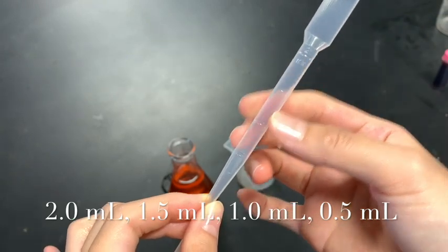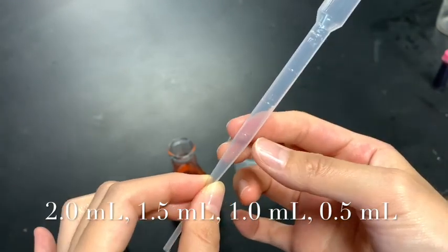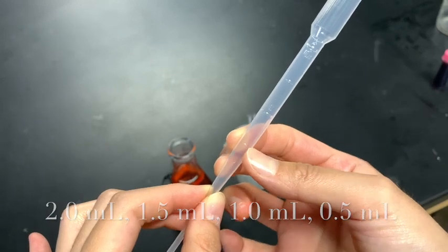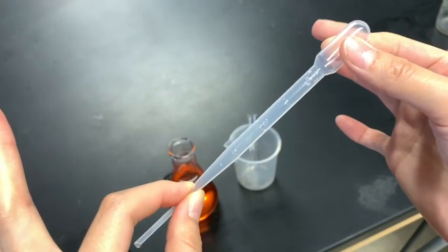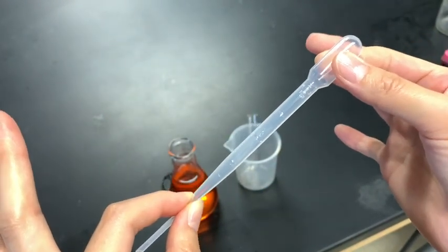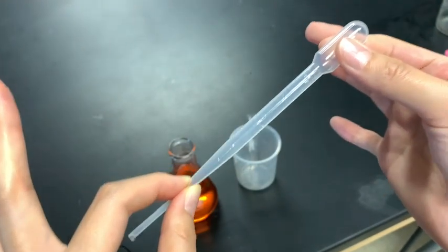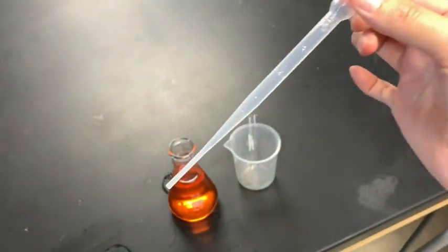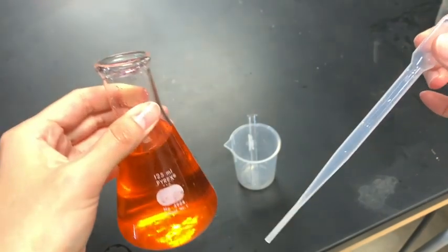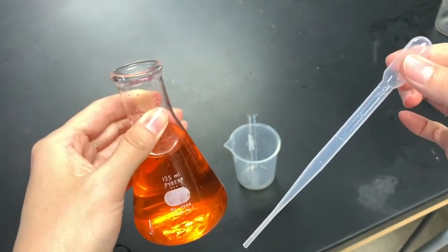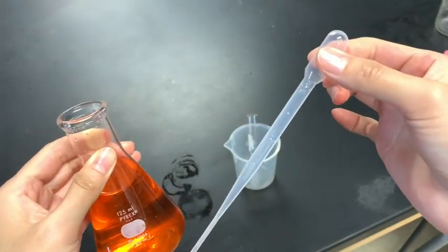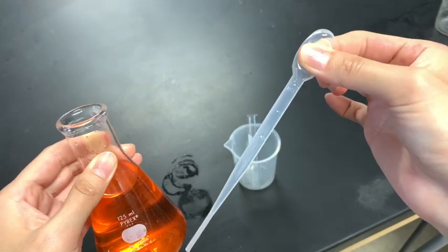In this video I'm going to demonstrate how to transfer 1 milliliter of solution into a test tube. Here is some water - I added some food coloring so you can easily see what I'm doing. First, you have to apply some pressure on the bulb.